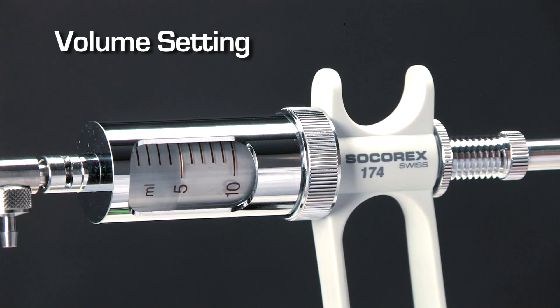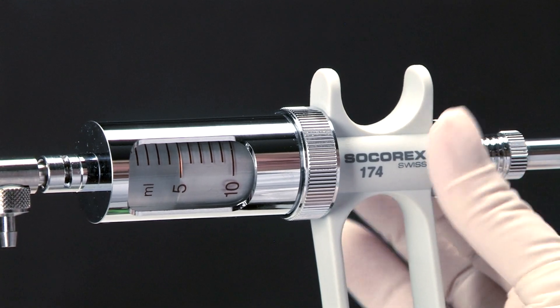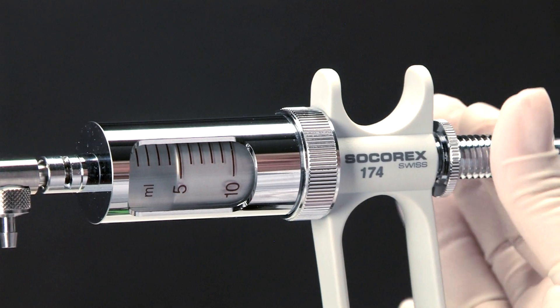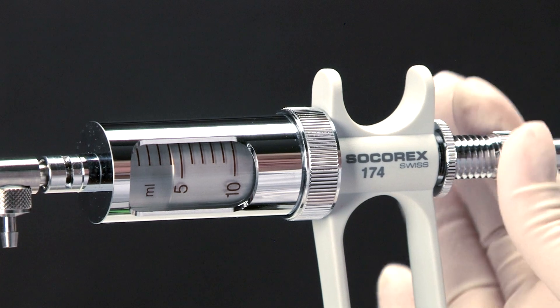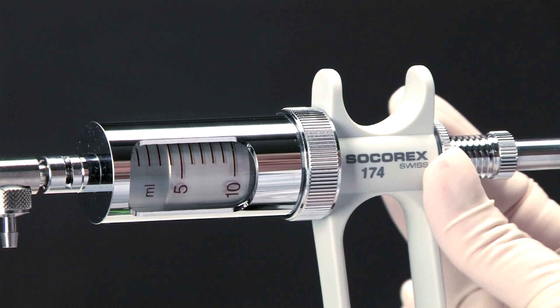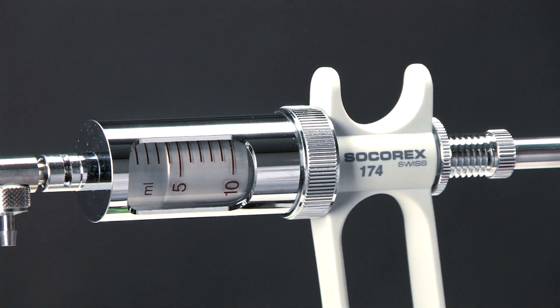Volume is set within seconds. Unlock the safety locking nut and turn the micrometric screw until the plunger edge reaches the appropriate position on the barrel graduation. Tighten the locking nut. The volume will not vary while activating the syringe, providing excellent dose-by-dose reproducibility.